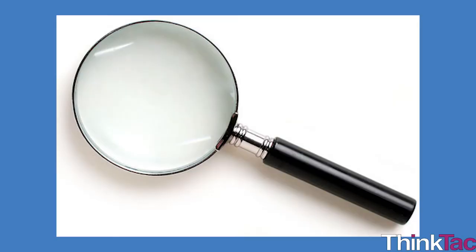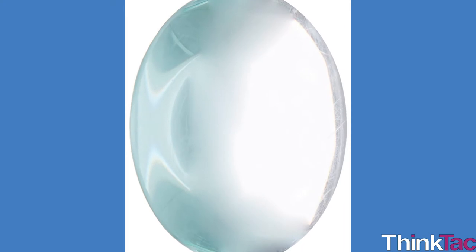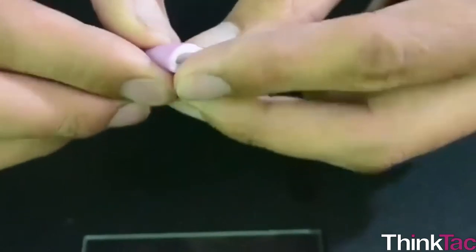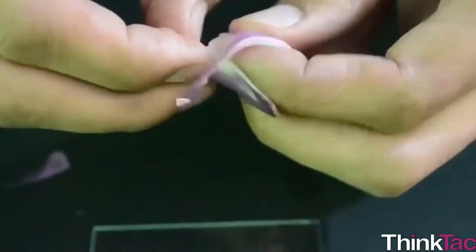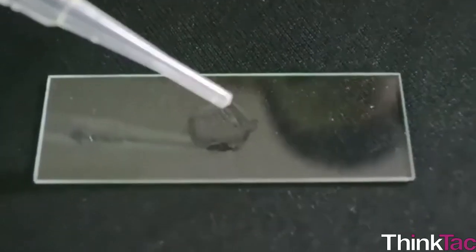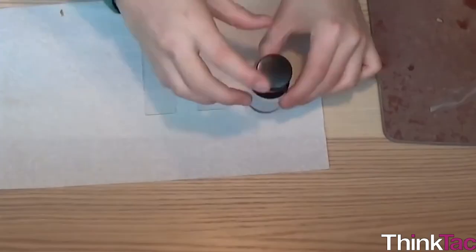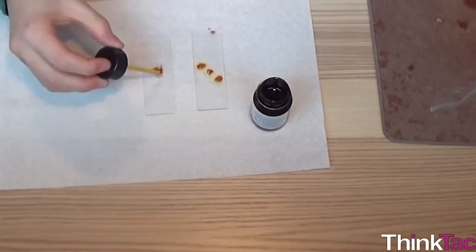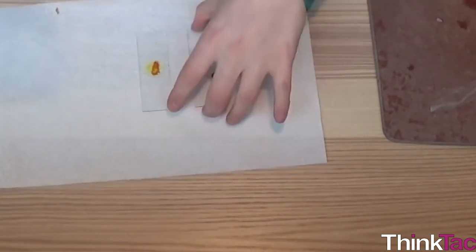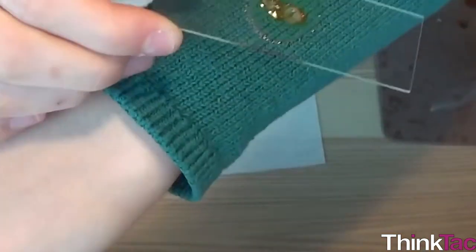But wait — don't you want to know why or how these glass beads make small things look big? Have you seen a lens or a microscope? Aren't the glass lenses bigger? And about the onions — what are you able to observe through the lens? Why do we add water to the peel, and why do we need a stainer like saffronin or iodine? To understand the importance of saffronin, repeat this activity without adding any saffronin solution.